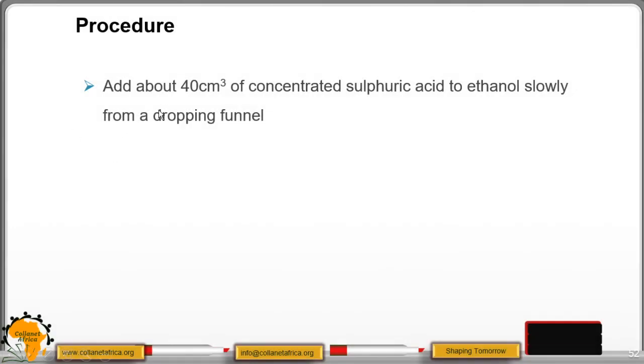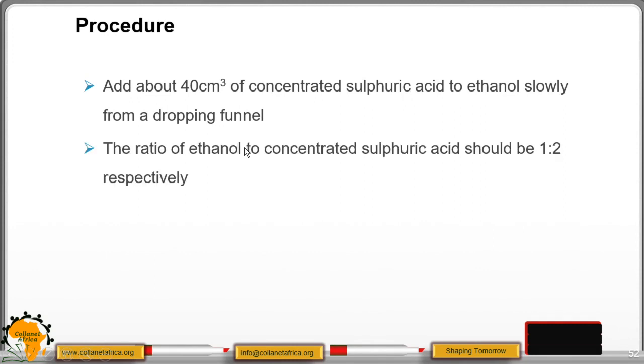Add about 40 cm³ of concentrated sulfuric acid to ethanol slowly from a dropping funnel. Then the ratio of ethanol and concentrated sulfuric acid should be 1 to 2 respectively. Remember, it has to be concentrated. If you use dilute sulfuric acid, you will not be able to get the product because dilute sulfuric acid is not used as a dehydrating agent.